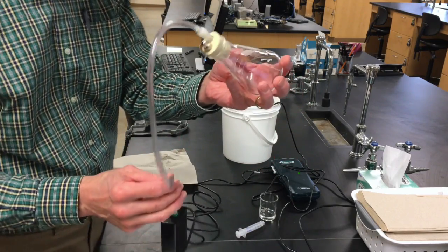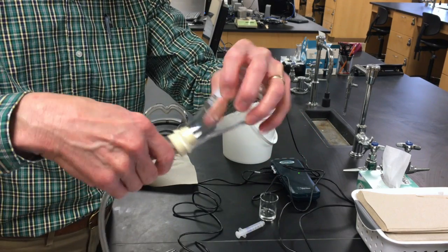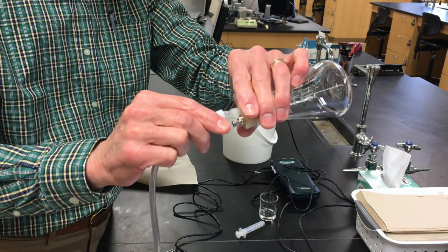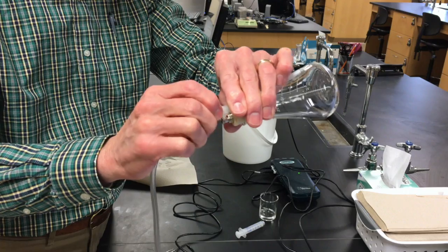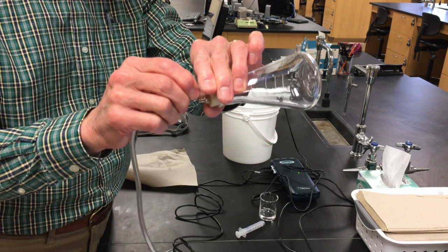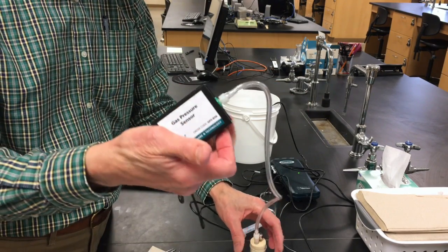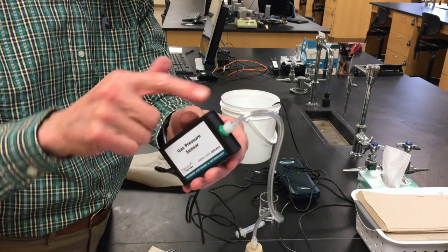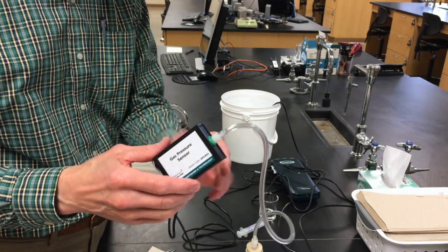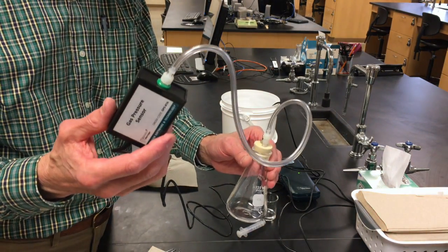The other thing, while I'm showing you this, is to make sure that this is sealed well. This does unscrew like that, and when you put it together, be sure that it's good and firm there, and not too tight or you're going to strip it, but it should be good and snug. And then the same with the other side, on the sensor side, be sure that this one is snug, a good strong finger tight. That will make a good seal.